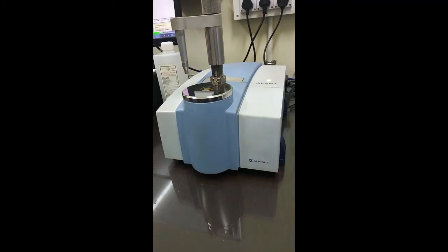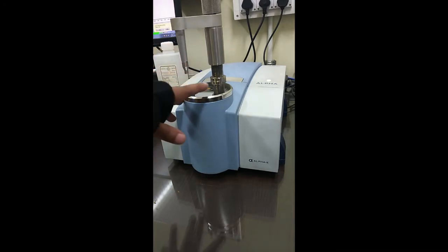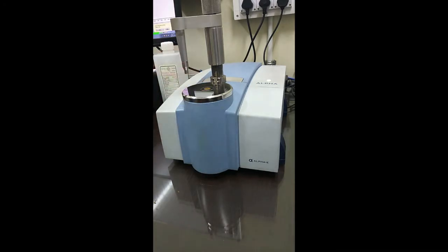During the sampling, the sample is placed at the ATR crystal so that there occurs maximum contact between the sample and the ATR crystal, and the IR light that comes from the downward passes through the crystal and gets reflected internally, and then finally gets absorbed by the surface of the sample.